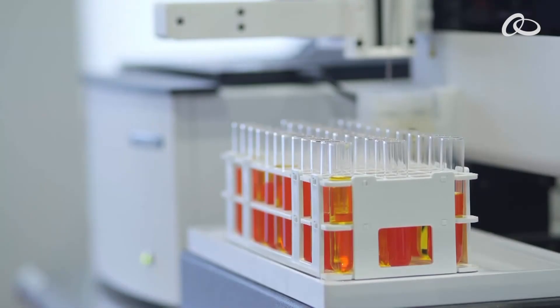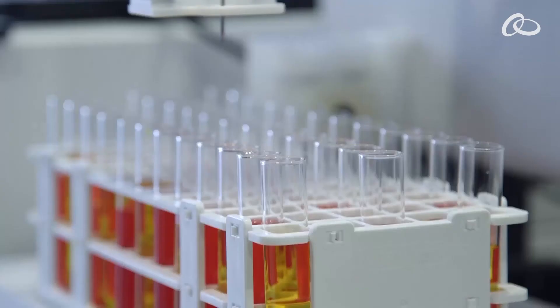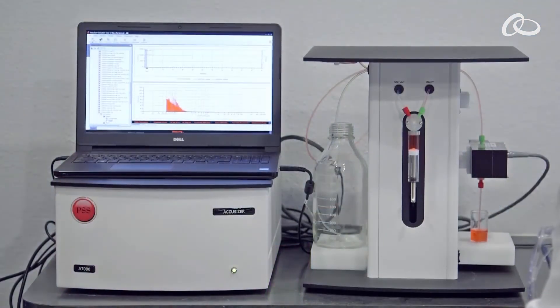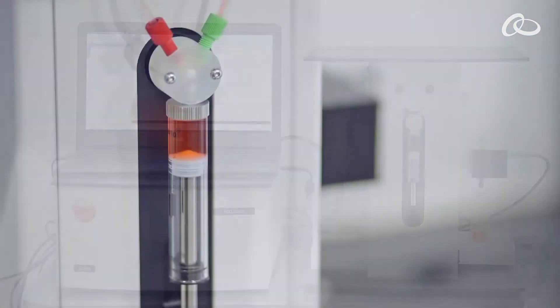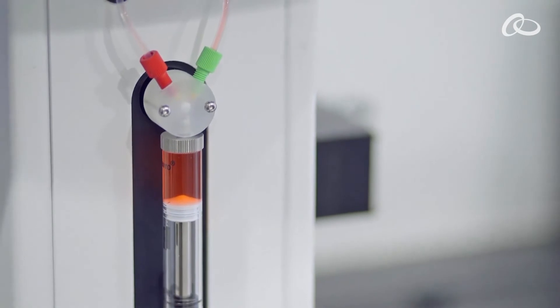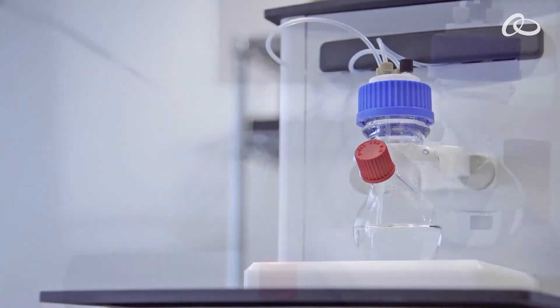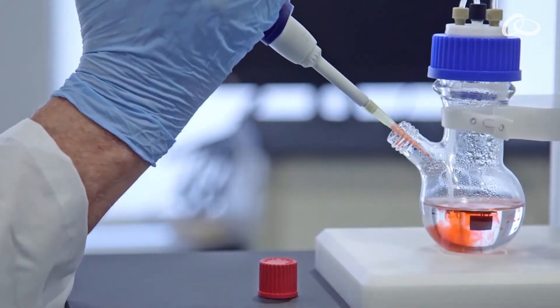Transporting the sample through the sensor is accomplished in the lab with the use of an automated sampler. The AccuSizer SIS aspirates low-volume samples through the sensor without dilution. The AccuSizer AD provides automated single-stage exponential dilution for concentrated samples.